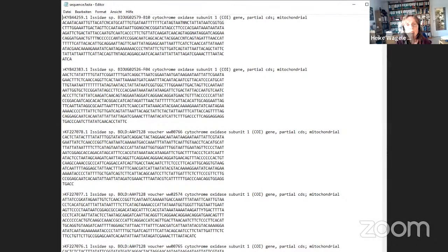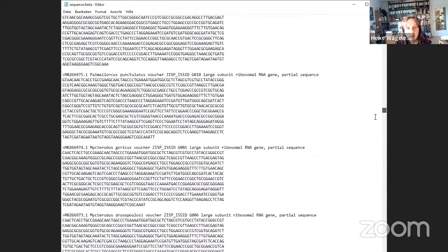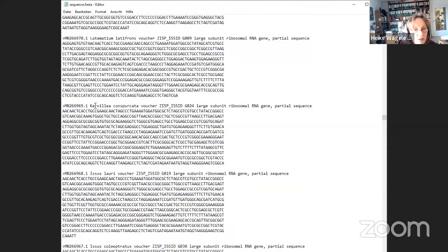And that it did not work with the subunit 1 is because when we go for here, the ribosomal, there's somewhere a 1. There's also a 1 in here. That's probably why. And that's why it's using also this information, because it's not in a row. When we have it separately, it searches independently in this row. So if you would go for partial sequence, it doesn't matter where the partial sequence is mentioned. Or partial, it would just search where this is in there. Yeah. Okay.